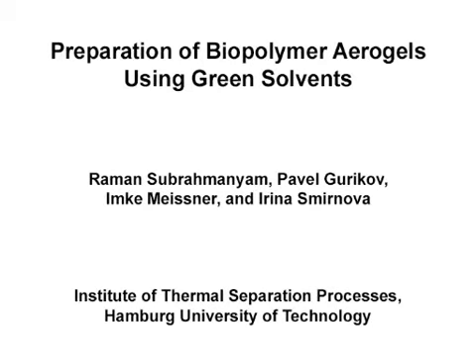The overall goal of this work is to visually demonstrate the production techniques of biopolymer aerogels using amidated pectin as a model biopolymer and water, ethanol, and carbon dioxide as solvents. Biopolymer aerogel production is a three-step process which utilizes water for the gel formation, ethanol to replace the water, and supercritical CO2 to remove the ethanol.